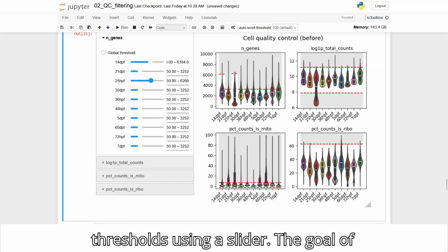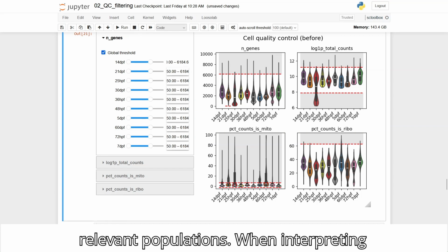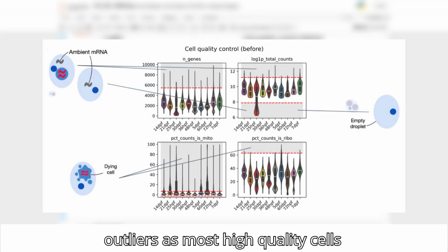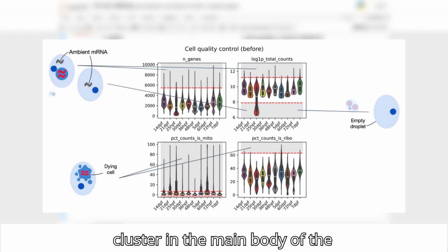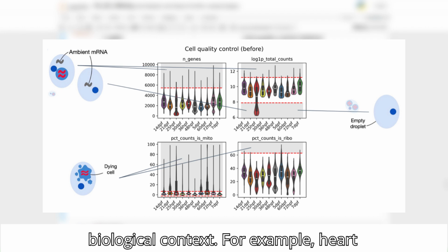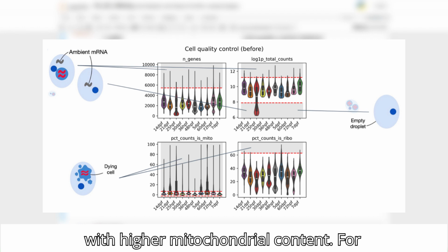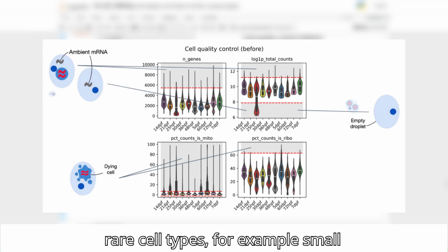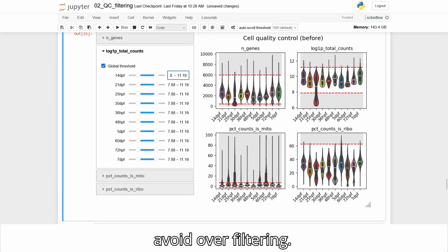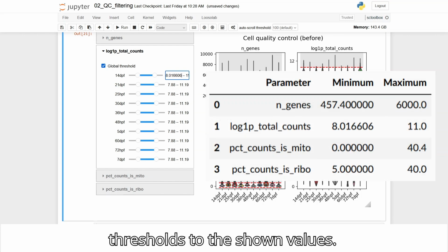The goal of this step is to remove low-quality cells while preserving biologically relevant populations. When interpreting the violin plots, focus on excluding outliers, as most high-quality cells cluster in the main body of the violin while balancing the technical and biological context. For example, heart samples may intentionally retain cells with higher mitochondrial content. For rare cell types, for example, small clusters, use less strict thresholds to avoid overfiltering. For this dataset, we will set the thresholds to the shown values.